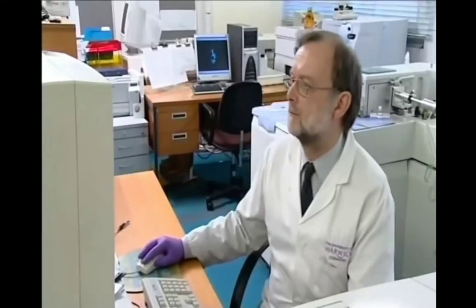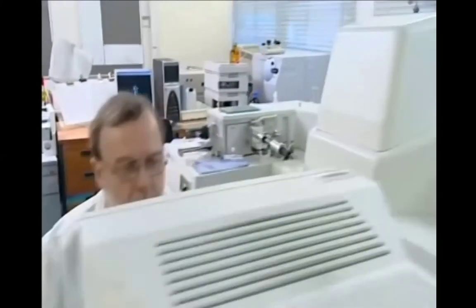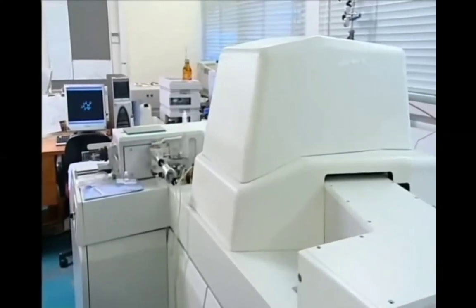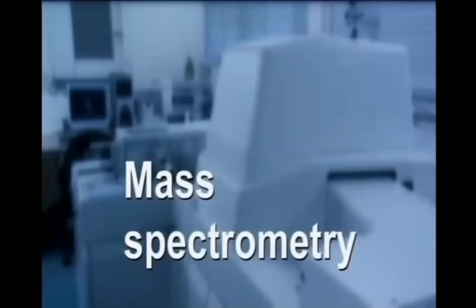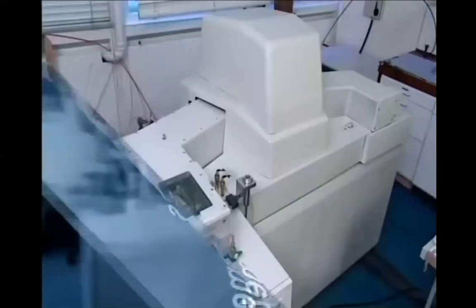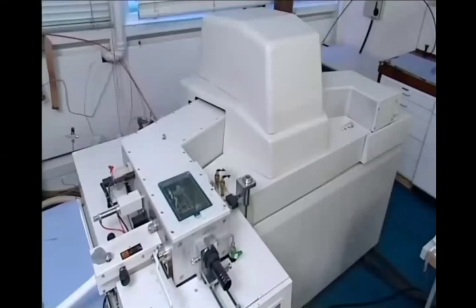Mass spectrometry allows chemists to weigh atoms and molecules not directly on a balance, but by measuring how ions formed from them are accelerated and deflected by electric and sometimes magnetic fields. There are many types of mass spectrometer, but they all work on this basic principle. This instrument is called a magnetic sector instrument.